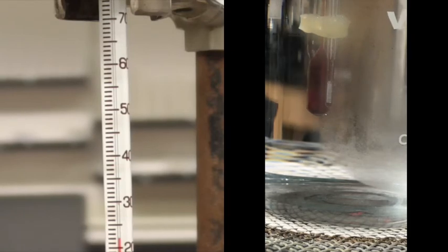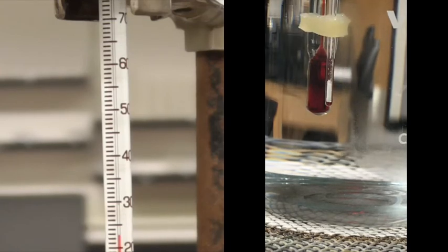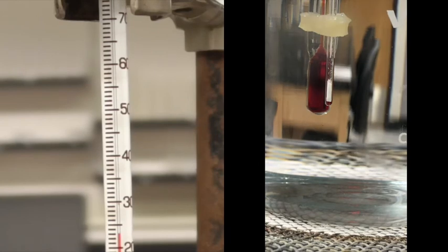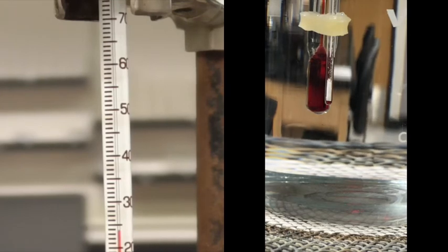And as that goes up, I will zoom in a little bit. It's fogging up a little bit, that'll clear up. There we go. Alright, so again, we're looking for a range, so we're looking for when it just first starts to melt, get a reading, and then when it's all gone. So we're going to have a range.